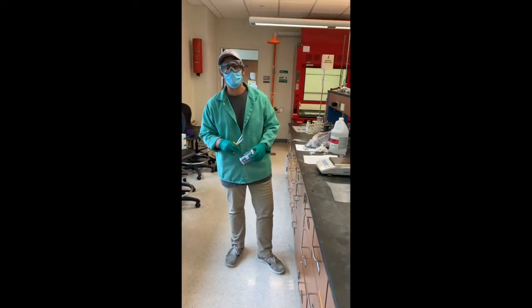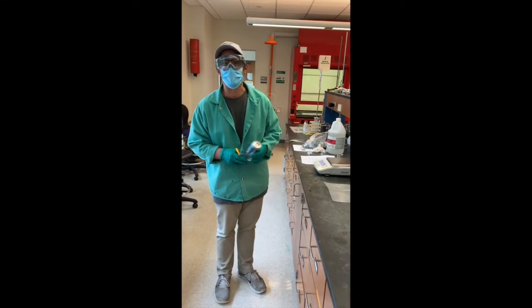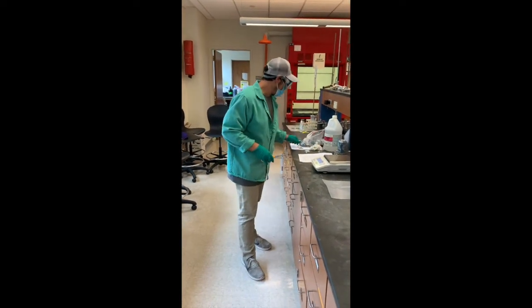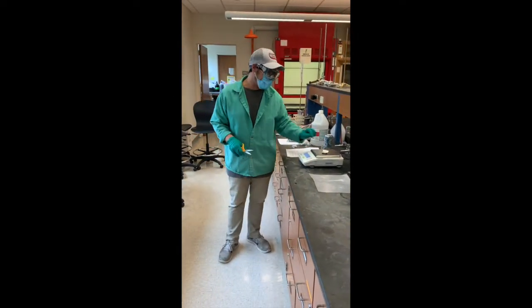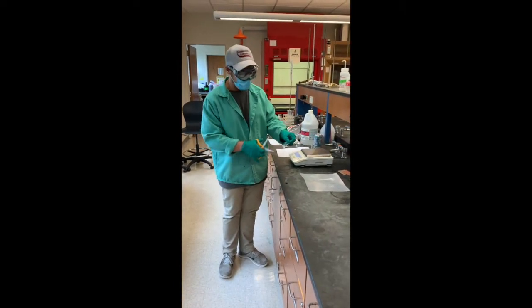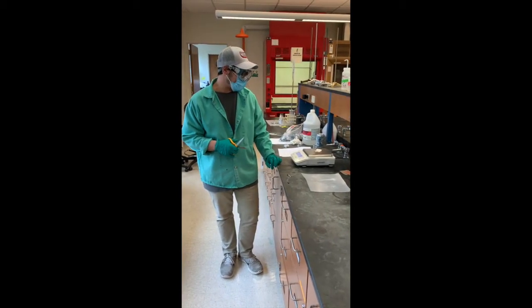Hi everyone, and welcome to the experimental video for the preparation of alum from aluminum cans. What we're going to do first is obtain a piece of aluminum that is going to mass approximately 0.3 grams. So we'll have some aluminum squares for you out on the bench. You'll just have to find one that is about 0.3 grams.